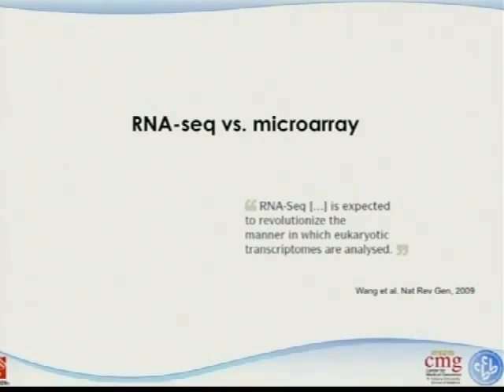None of these studies was done by me. We did have experience, but these are the data from other people. Okay? So RNA sequencing is expected to revolutionize the manner in which eukaryotic transcripts are analyzed. This is out of this review paper.